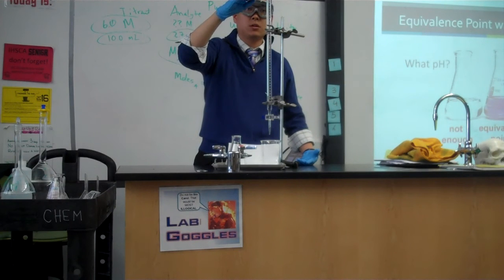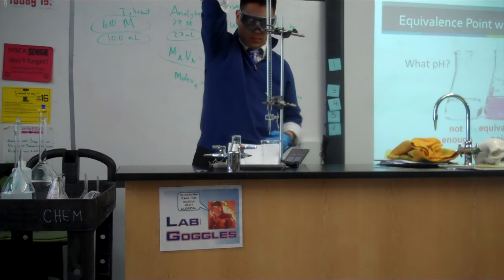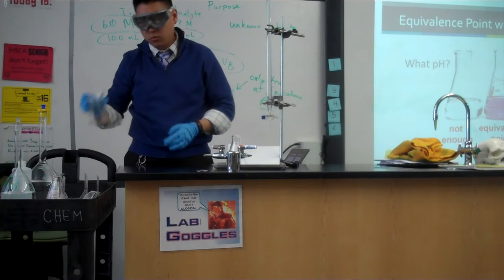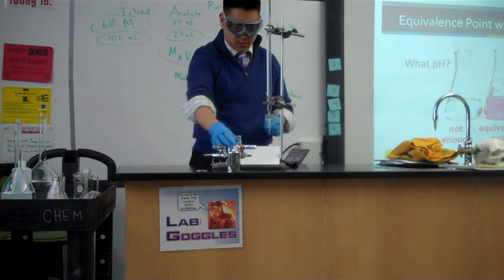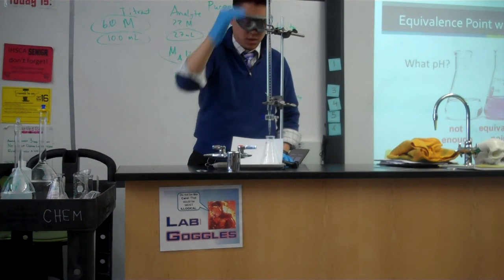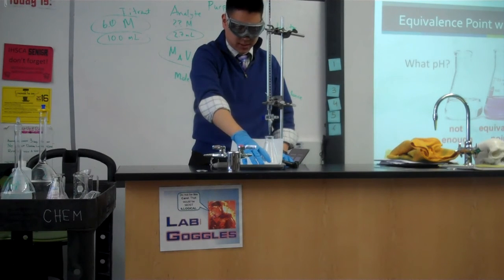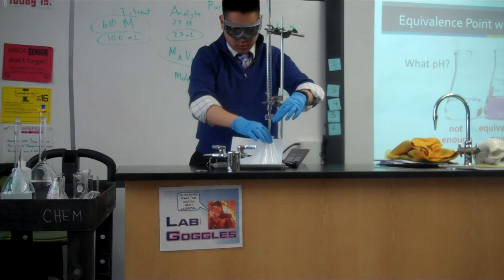Because this is our start, I need to record that. I'm going to remove this. Alright, and then we can put this to the side. We are still going to need this for the future. Now we're going to start our titration. I know that this was 20 milliliters at the start. I know we used 25 milliliters of our hydrochloric acid, which we don't know the concentration of.